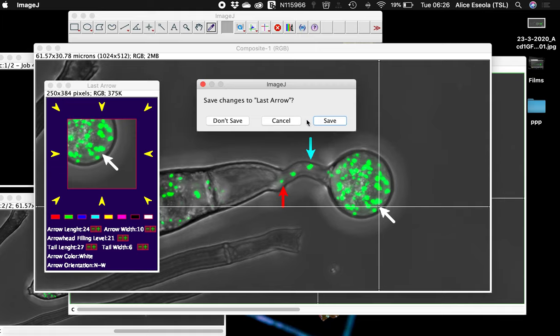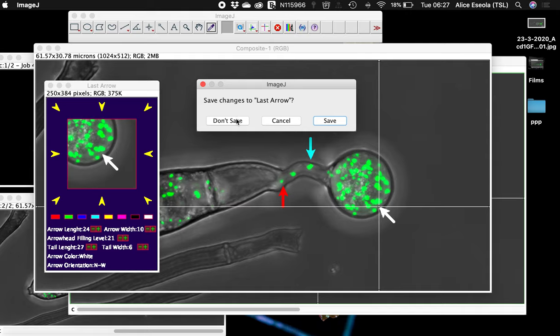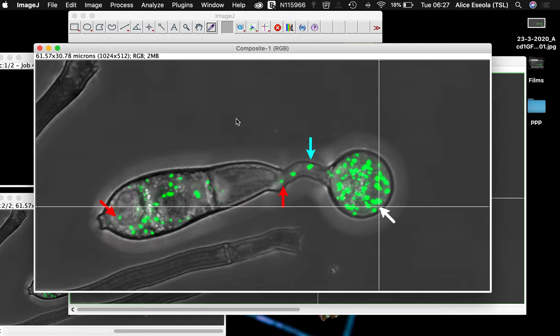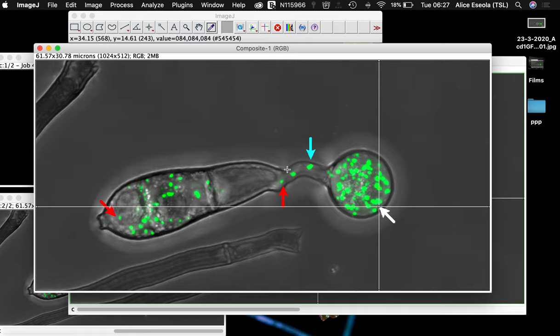If you want to reuse this white arrow location, you can decide to save the arrow location. But I don't save them because I prefer to choose the location I'm pointing to at different times.